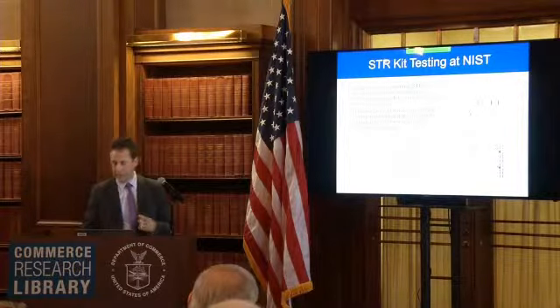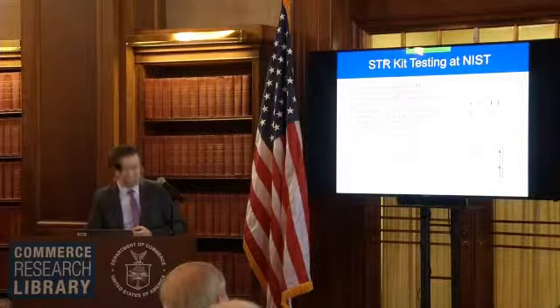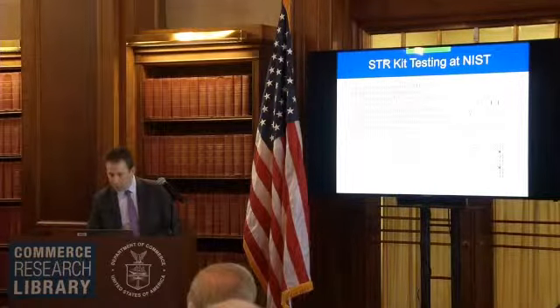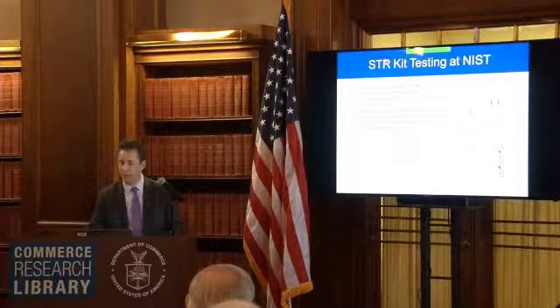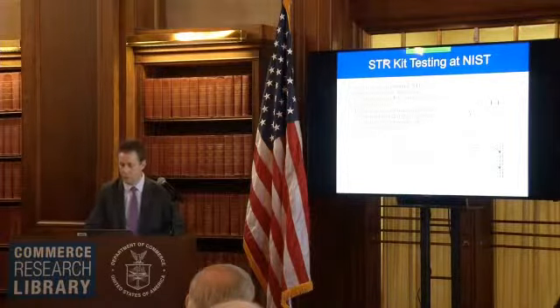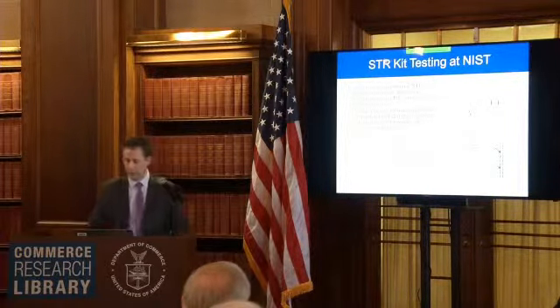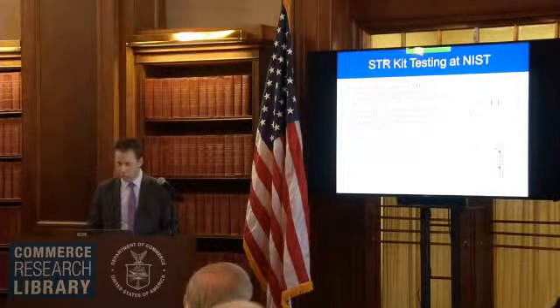It's a little bit hard to see here, but there are two peaks, I think a 13 and 15, but in the newer kit it was just a 15-15, so you have a dropout of a peak, and that could be adjusted by a sequence change in the primers that we talked about. I'm not going to get into too much detail, but just to state that this kit testing has been useful for supporting the development of these with the U.S. industry.